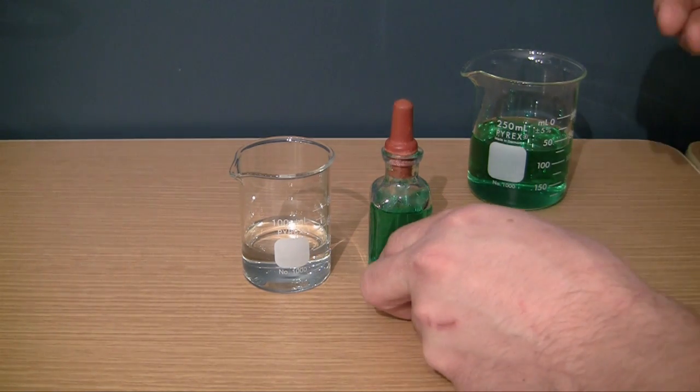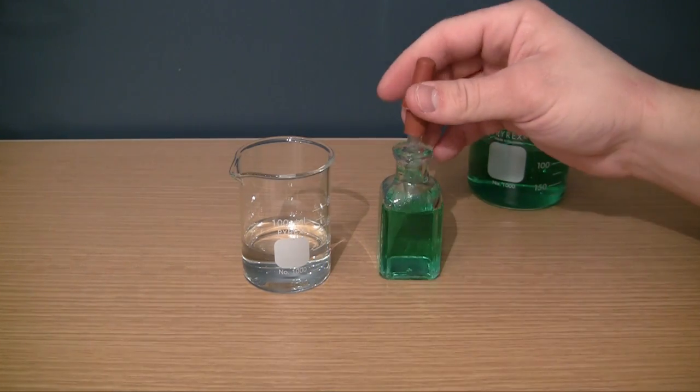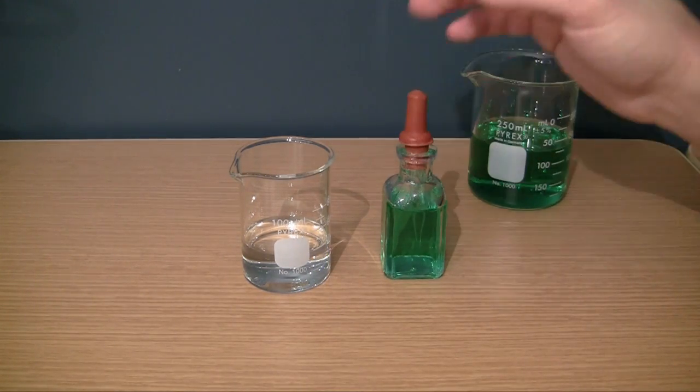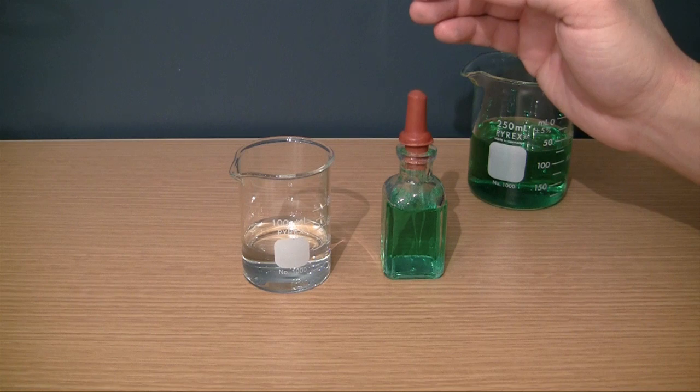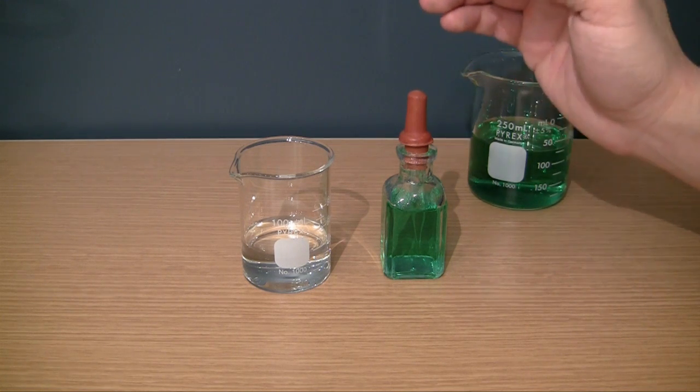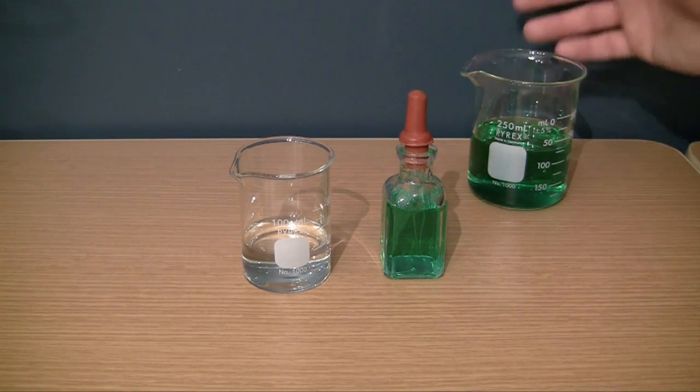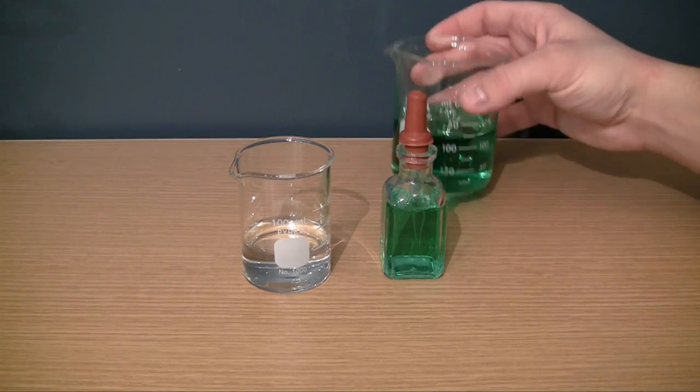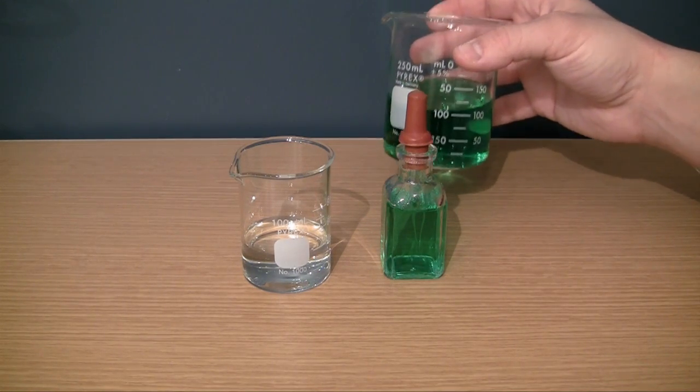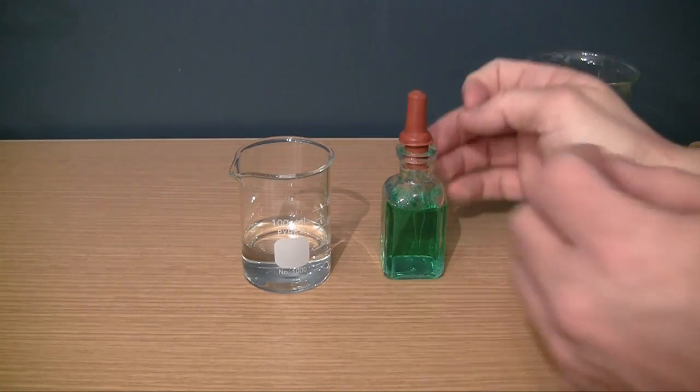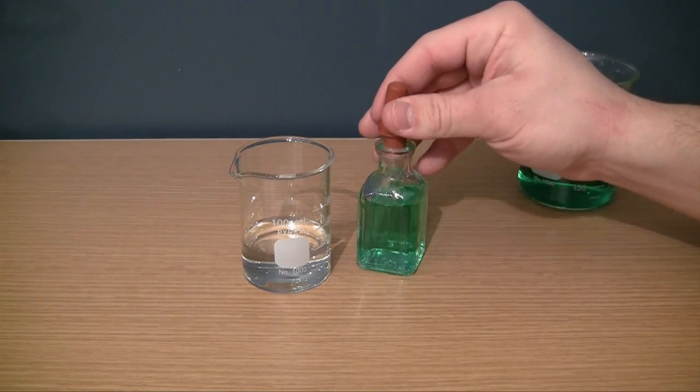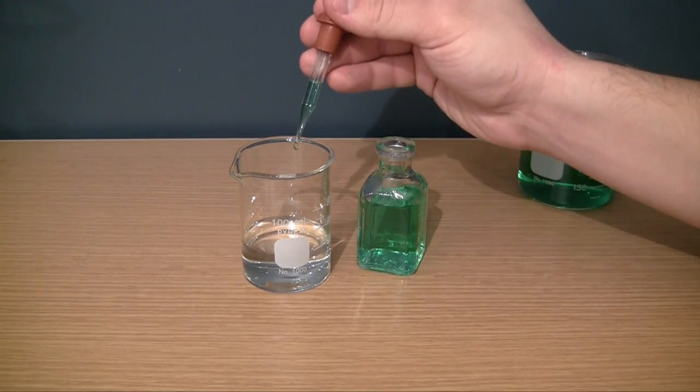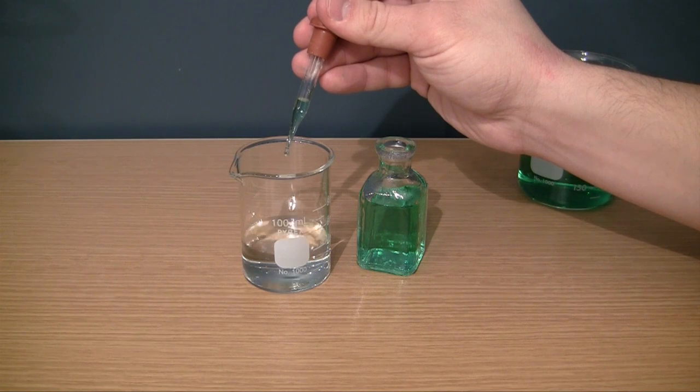But basically what it is is a container that you use to store chemicals but only the chemicals that you want to use in very precise amounts, aka drops. Whenever you want to deliver like 200 milliliters at a time it's better to use a beaker but whenever you're working with very precise measurements and you need to deliver it in drops then check it out. Pretty freaking handy.